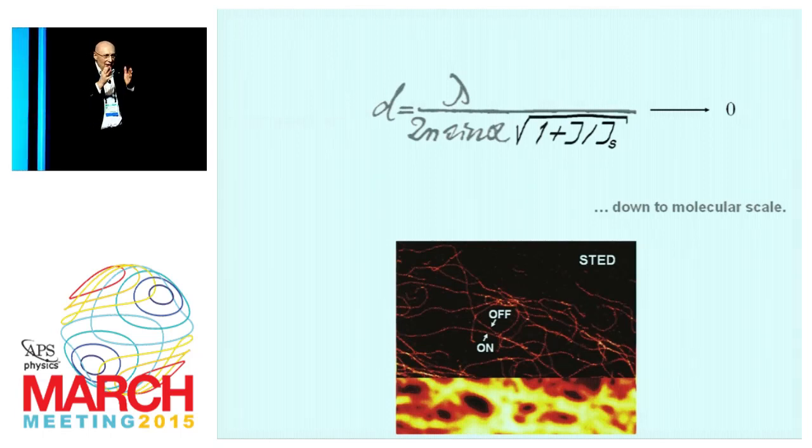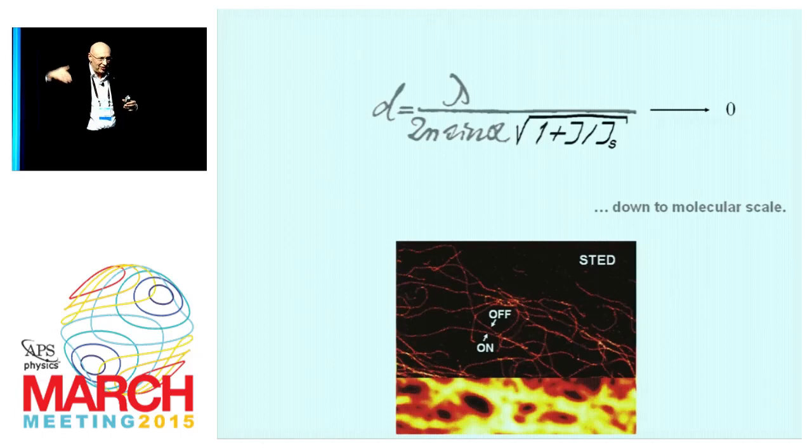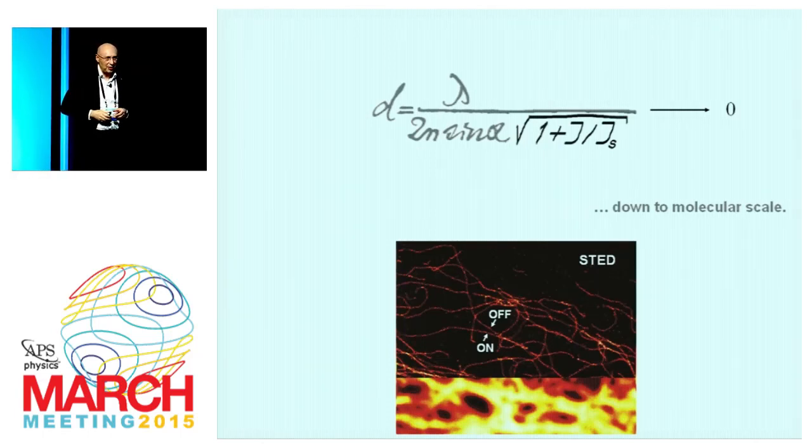So there is no specific resolution that you get for a certain method, because it depends on the molecules. In the end, the development of the molecules determines the resolution that you get today and in 2 years or in 4 years or 5 years. But the conceptual limit is the size of the molecule.